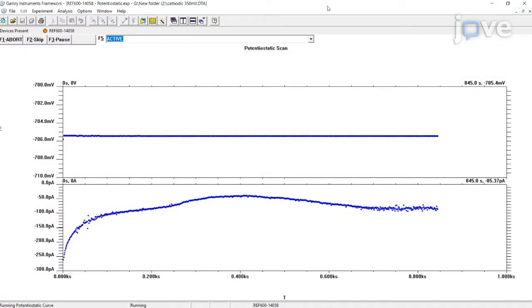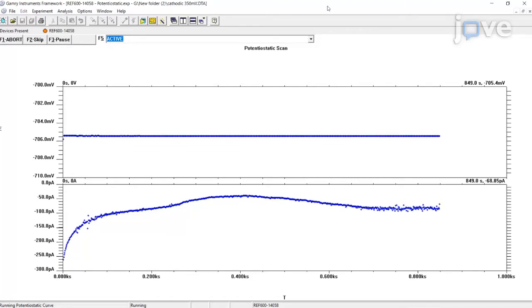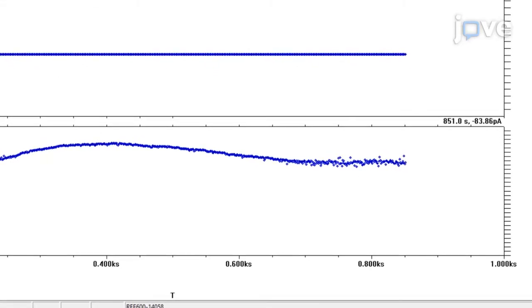To set up the wear test, in the Universal Mechanical Tester software, apply a 1 Hz scratch frequency, 5 mm scratch length, and 0.5 N normal load. Then click Run to begin the tribo-corrosion.